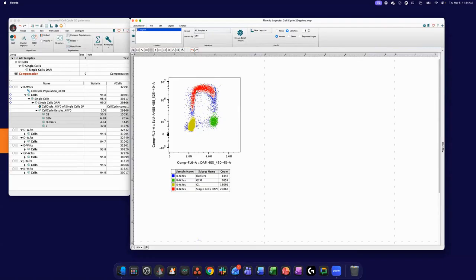Okay. Right, the blue tends to be in the outskirts of the S phase. So these events, for instance, are in between the G1 and the S, so the algorithm's not sure if it should put them here or here. So it just puts them there as an outlier. Okay, so it does some binning decisions. But overall, it does a pretty good job.